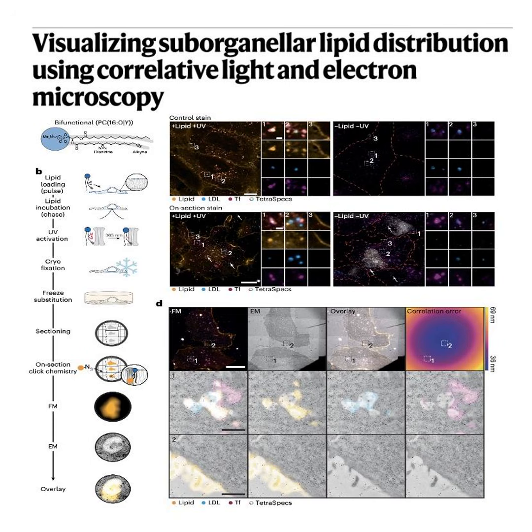So they tracked a highly specific lipid called sphingomyelin, or SM, utilizing that polar K11M resin to get its true 3D density. Did the sphingomyelin just randomly smear across all the compartments? It emphatically did not. The mathematical distribution here is staggering. The sphingomyelin was heavily enriched in the intraluminal vesicles, the destruction route marked by LDL. How enriched? It's concentrated at 3.64 times the normal density. Conversely, it was deliberately depleted in the recycling tubules, the return route, at only 0.49 times density.